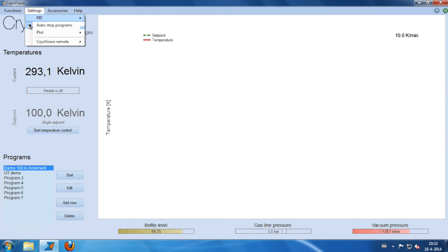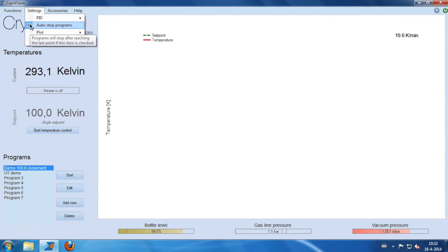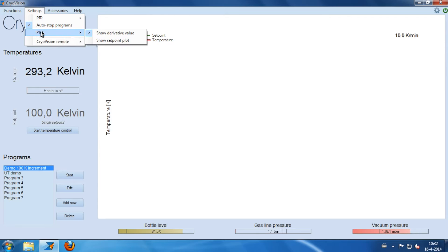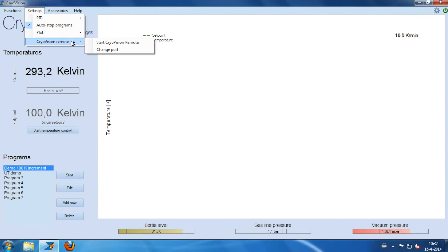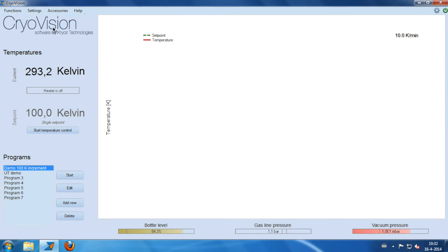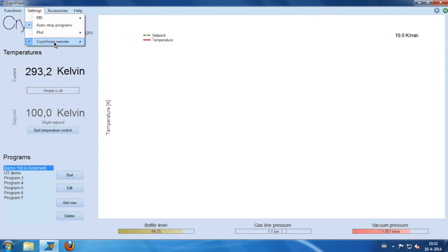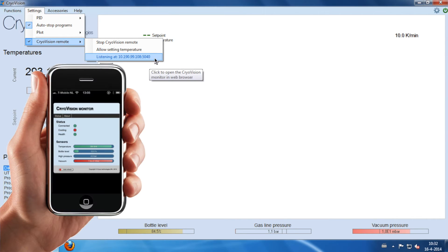In settings, you can enter custom temperature control values, auto-stop programs after they are finished, and choose plot options. Also, you can start a remote server to monitor your process from another computer or mobile device.